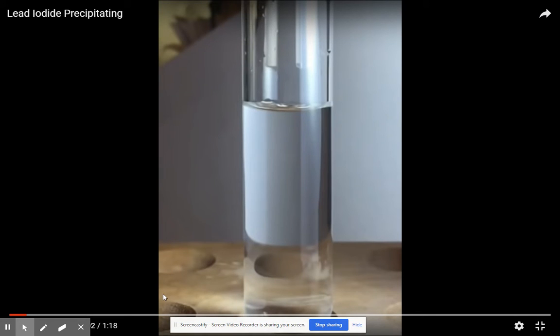Normally I would introduce solubility rules with a demo, but since we're not face to face, I have a short video clip showing the reaction of lead nitrate and, I want to say, potassium iodide. You'll notice that the solution in the test tube is clear and the solution in the pipette toward the top of the test tube is also clear. But I want you to notice what happens when we actually mix the two clear solutions together.